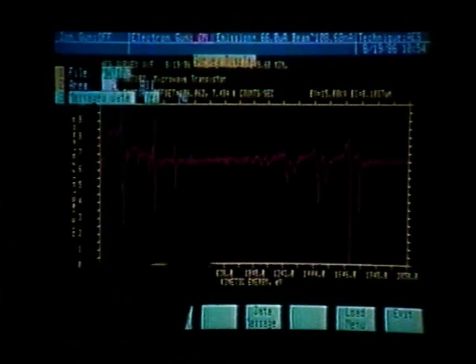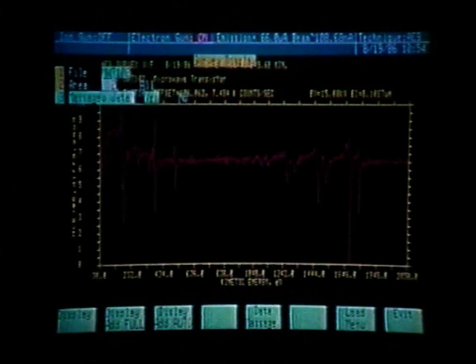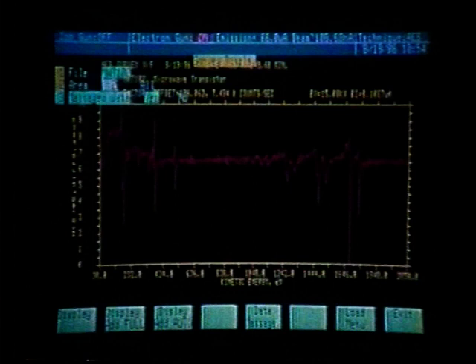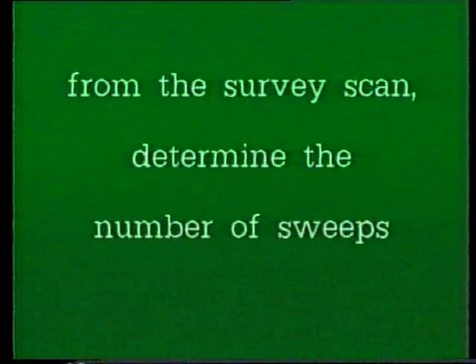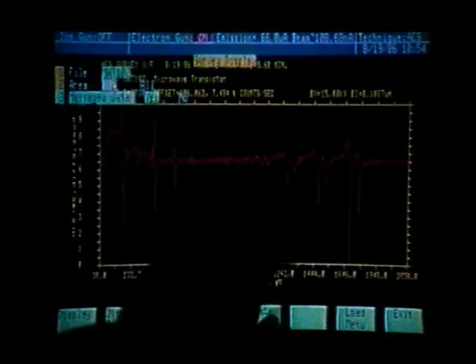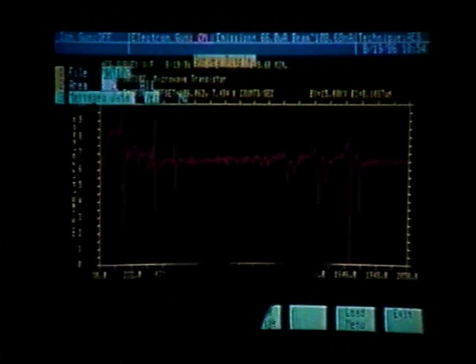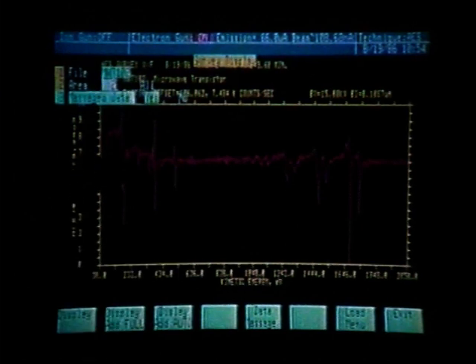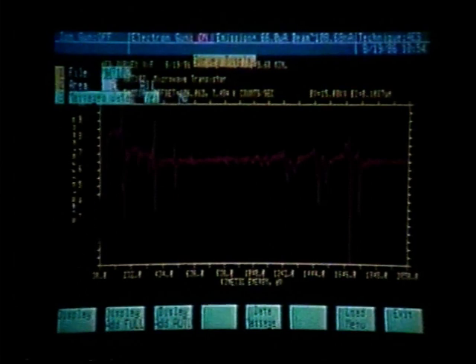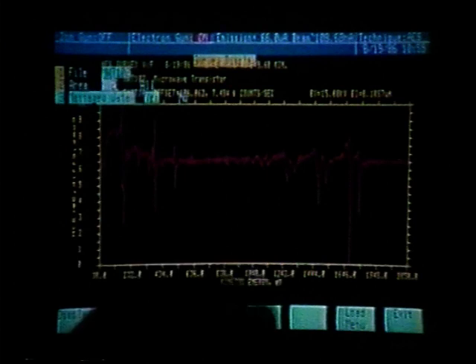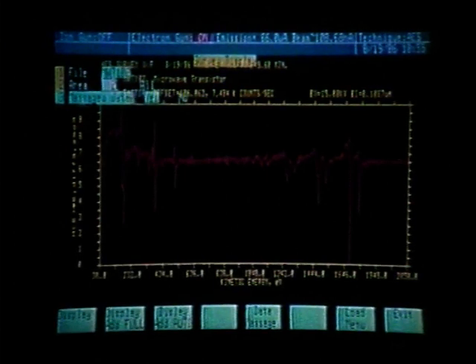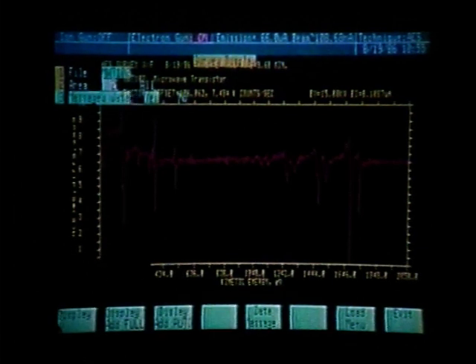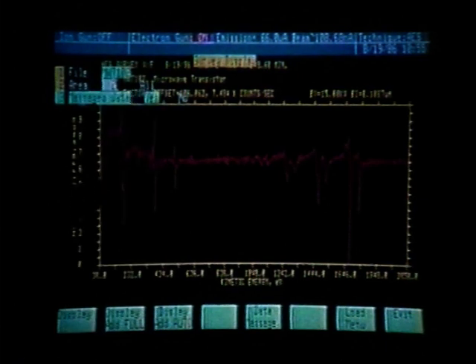When we set up for a multiplex, we also need to determine the number of sweeps we will spend on the peaks. In the multiplex routine, we must include all of the peaks we have identified, and it will set them equal to 100% and determine the atomic concentration. From the survey scan, we can determine the number of sweeps. We will look at the high energy tantalum peak, which is the largest peak. So if we do one sweep on tantalum, the carbon peak is much smaller — to get the same statistics, we should probably do 10 sweeps on carbon. So one sweep on tantalum, two sweeps on nitrogen, three sweeps on oxygen, and ten sweeps on carbon.